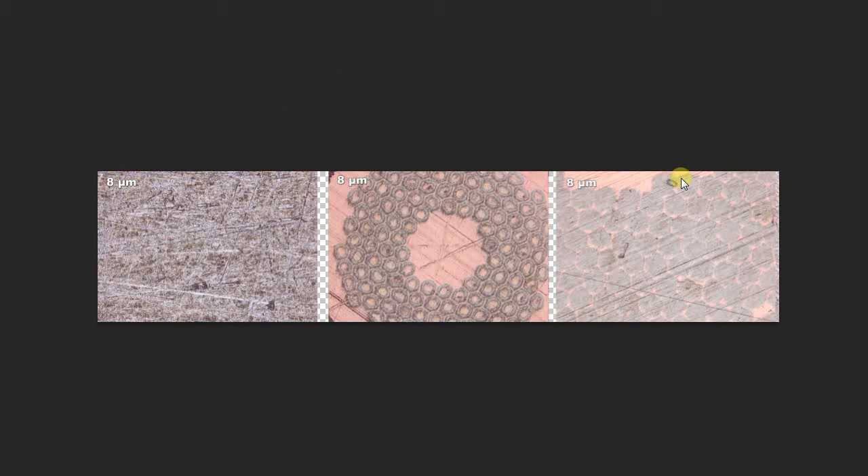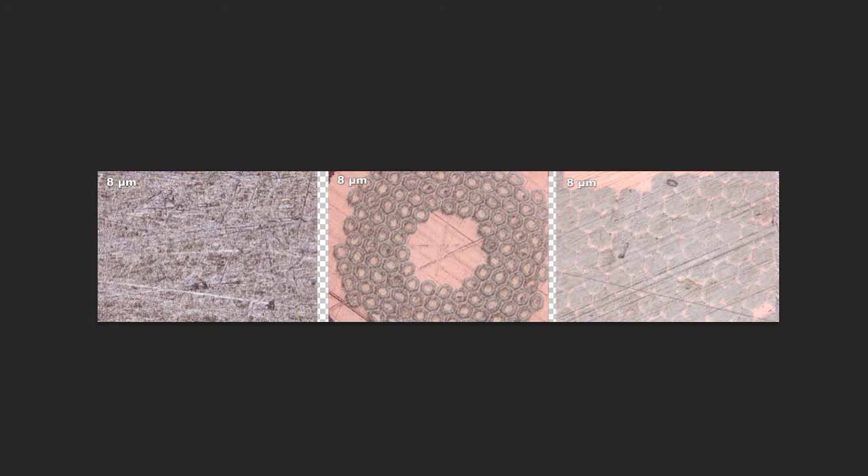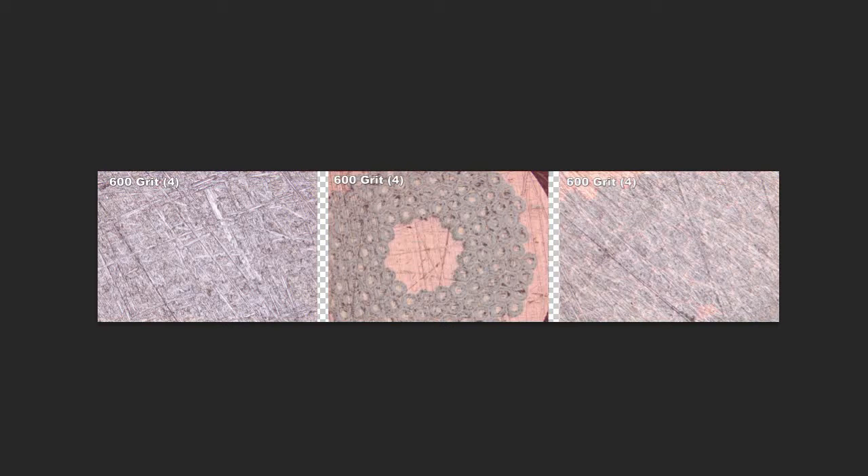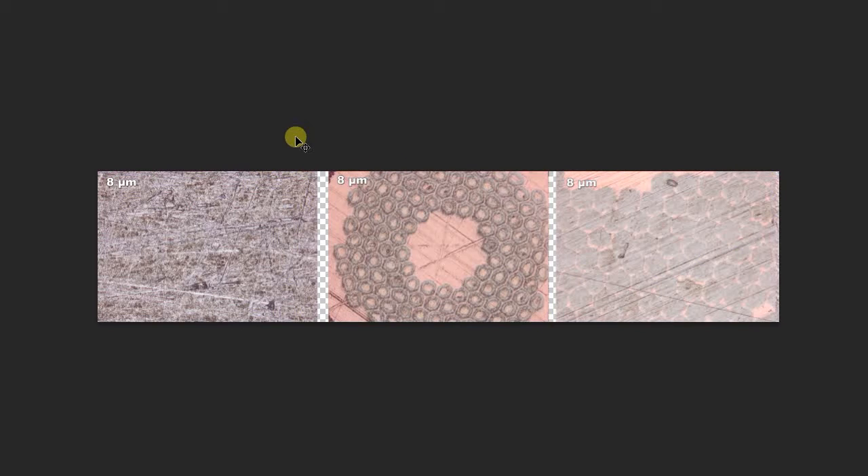I've done five minutes with the 8 micron pad and the samples are looking a lot better. Let's compare — this is 600 grit, the last step of 600. Notice it. Look at this one and check out how much the structure gets better. 8 micron versus 600 — much better. There's a deep scratch in here that I'm not happy about, so I'll probably do another five minutes. I find that doing transverse cross-sections like these, a total of 10 minutes in 8 micron is good enough. There are fewer scratches. Let's see what the diamond suspensions can do.